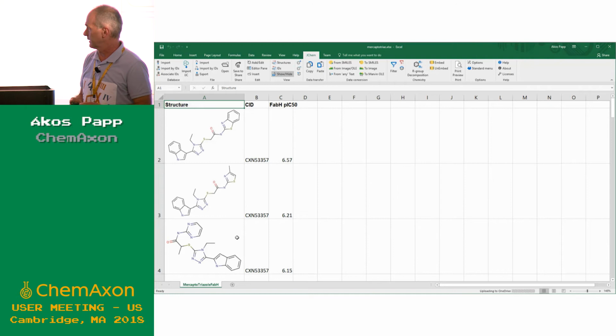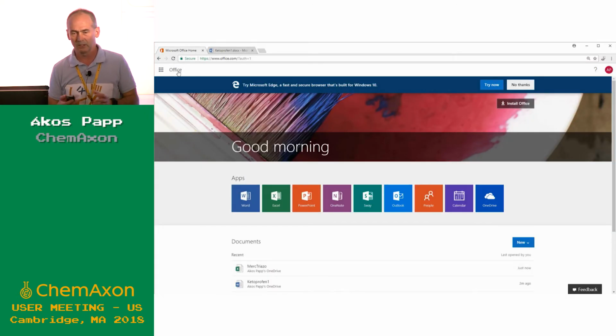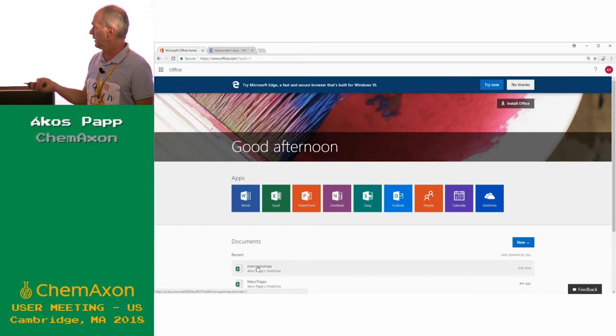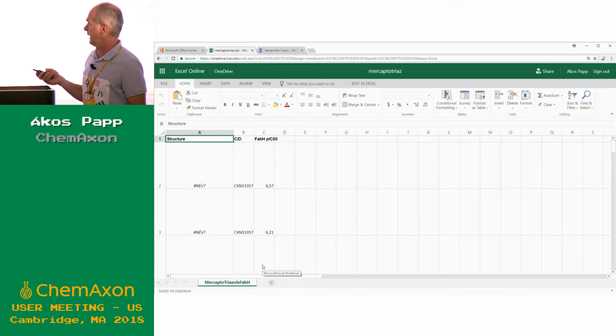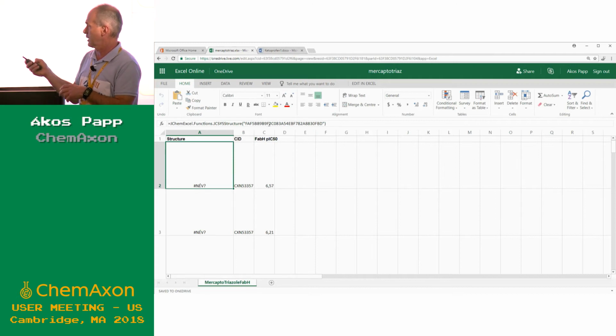And basically what we did is we created a browser extension. So currently it is in Chrome, done by a browser extension. So if I open my file, not surprisingly, you will see that Excel Online cannot do anything with this function. So it's hashmark name, and it says, okay, what is this function?